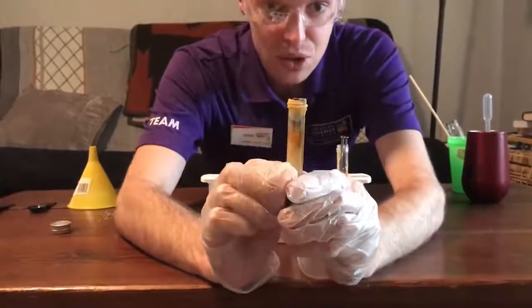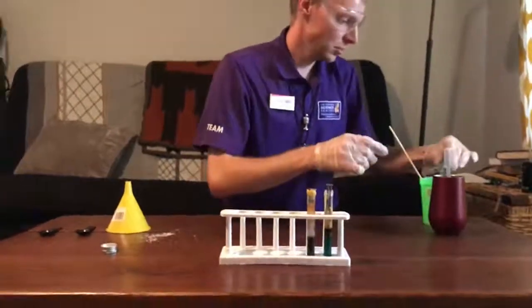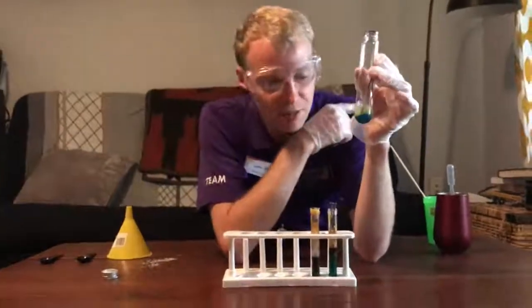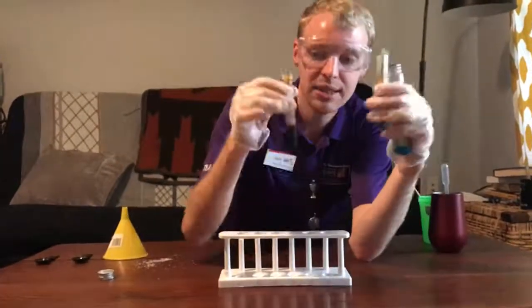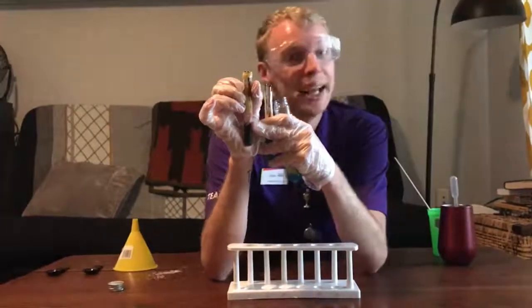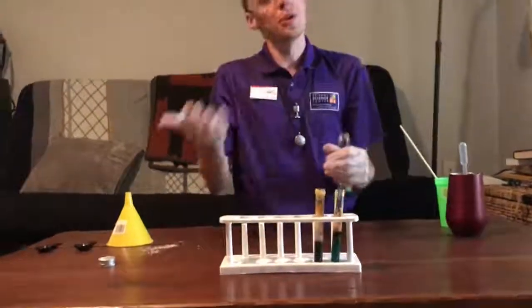So again, we start with something that is just a few different compounds and kind of looks like colored layers of mush. And we end up seeing that continue to separate and eventually leaving us with our very own pure forms of copper, which is really beautiful. And now you have seen how to use some chemistry and the power of single replacement reactions and bonding affinity to grow your own crystals.